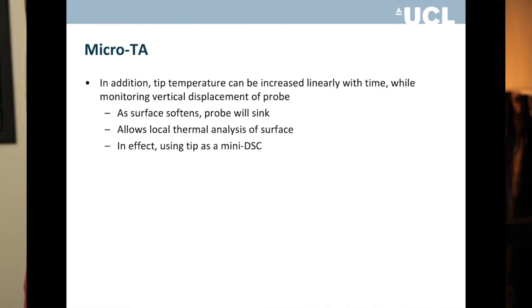So it's suggesting that there's an indomethacin particle exposed at the surface of an otherwise polymeric material. That's kind of cool, but there's one other thing that you can do with a microthermoanalysis probe like this. Not only can you pass a current through the tip to maintain it at a particular temperature, you can also pass a current through the tip to make it rise in temperature. If you make the tip rise in temperature, you're effectively doing a degree of thermal analysis.